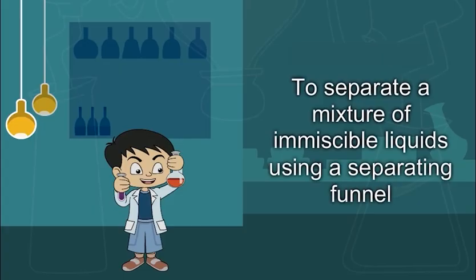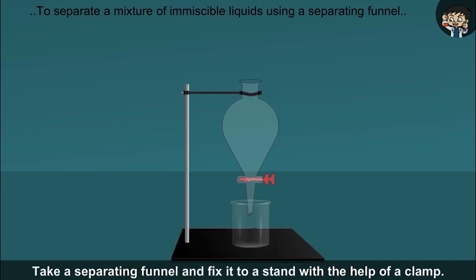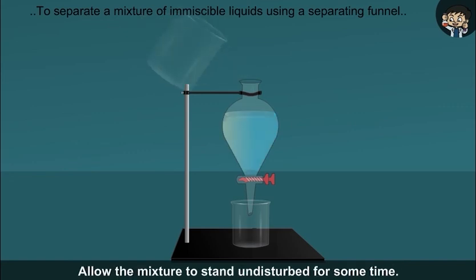To separate a mixture of immiscible liquids using a separating funnel. Take a separating funnel and fix it to a stand with the help of a clamp. Then pour a liquid mixture of water and kerosene into it. Allow the mixture to stand undisturbed for some time.